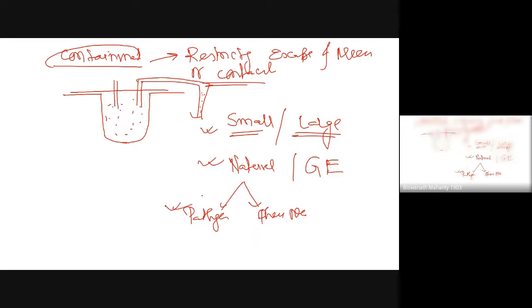Why am I talking about these suddenly in a bioreactor? Because you are doing the bioreactor operation, and depending on what microorganism I am dealing with, all the protocols for biosafety may change. For example, I may not allow the release of gas from the fermenter into your lab if I am dealing with a pathogen which is contamination level 3 or 4. So there is some biosafety standard, and I will be talking about the 4 different levels which people normally use, and that is what the WHO recommended.